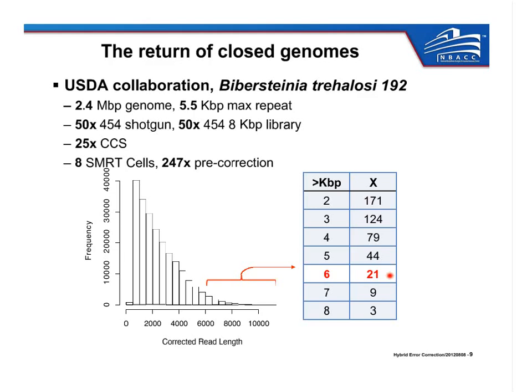So anytime we're doing a whole genome approach of, say, a bacterial-sized genome or larger, we would like to use a production assembler like Celera Assembler. Minimo, Minimus would work just fine for viral genomes or small bacteria, but really it's a scalability issue there. But yes, assembly of these corrected reads would work just fine in Minimus or Minimo.